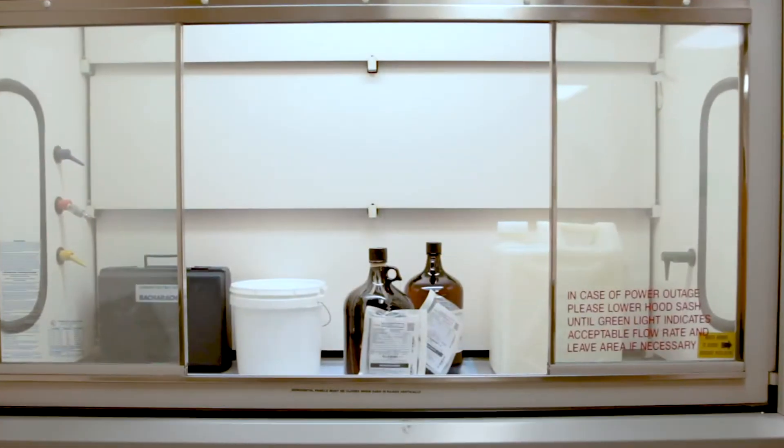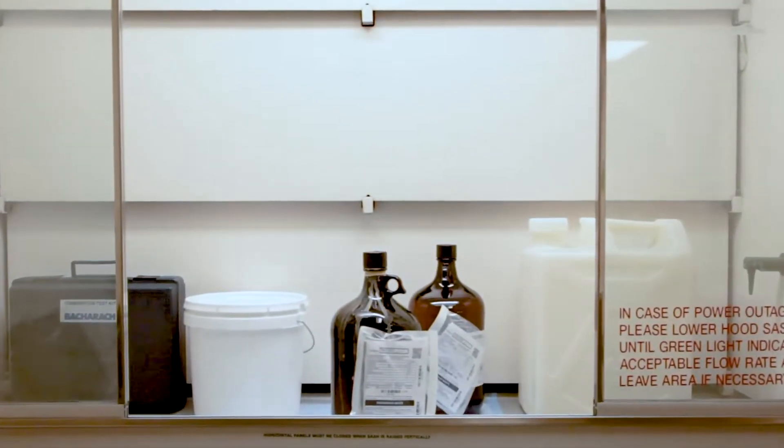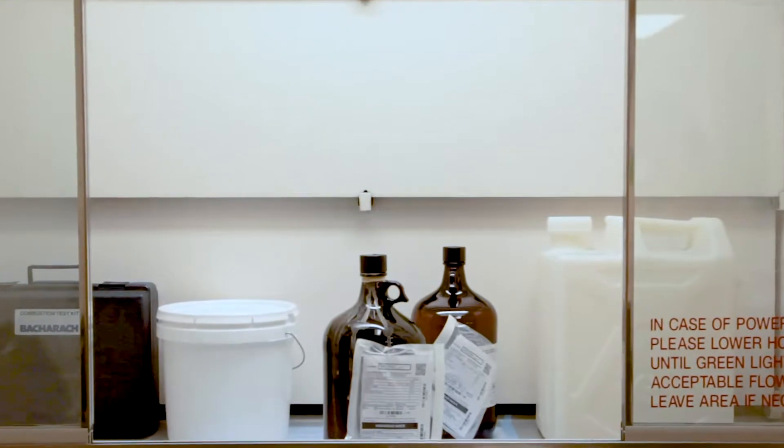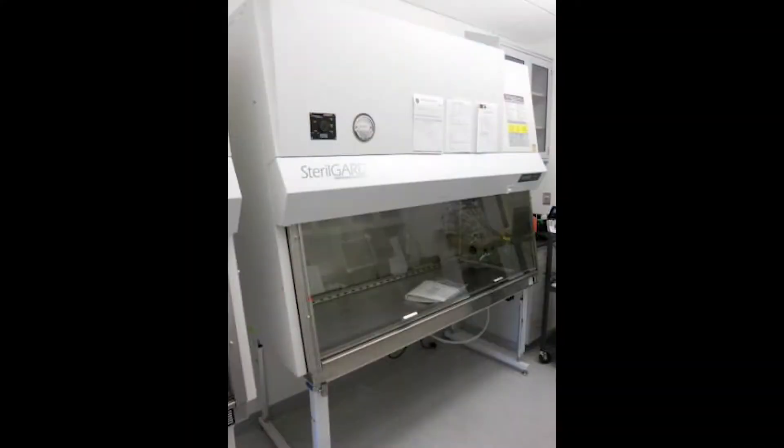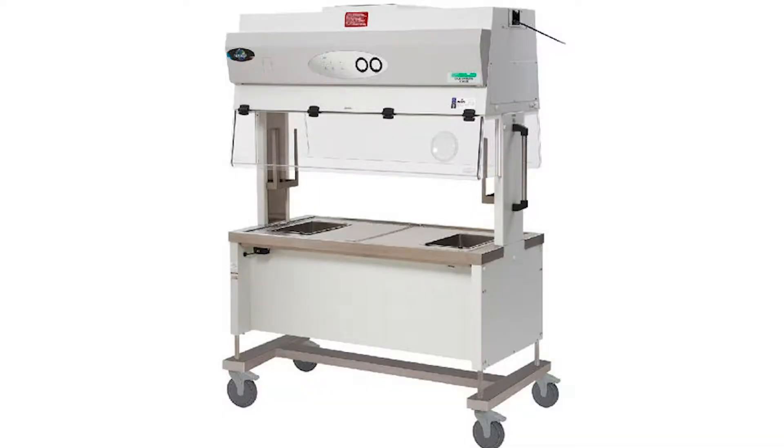Some laboratory equipment may resemble a fume hood, but they do not provide the same level of protection and should not be used for volatile chemicals. These include biosafety cabinets, laminar flow hoods, animal changing stations, and sterile work stations.